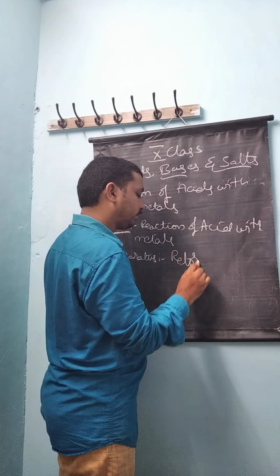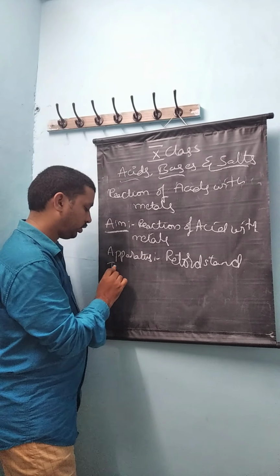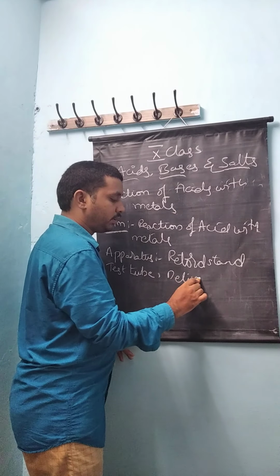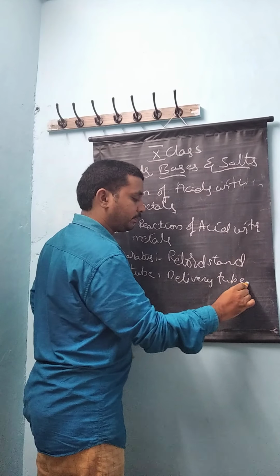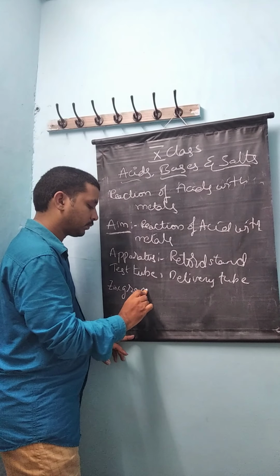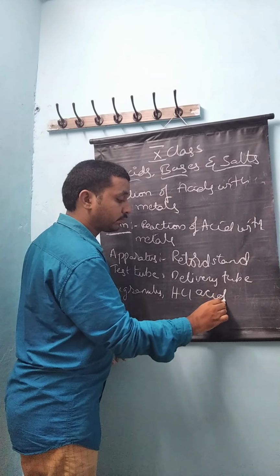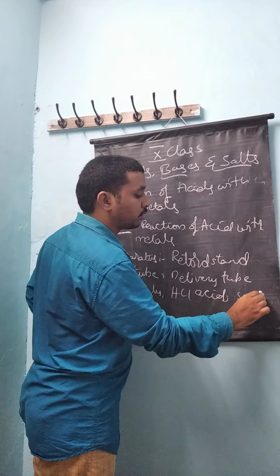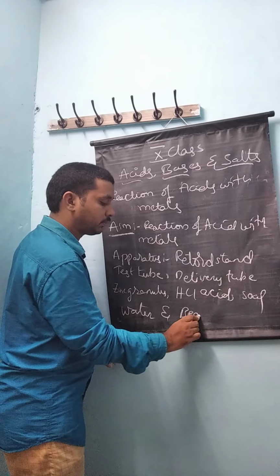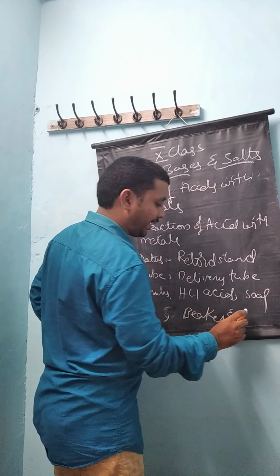Retort stand, test tube, delivery tube, zinc granules, HCl acid, soap water, beaker and a matchstick.